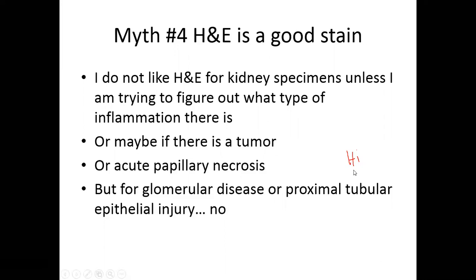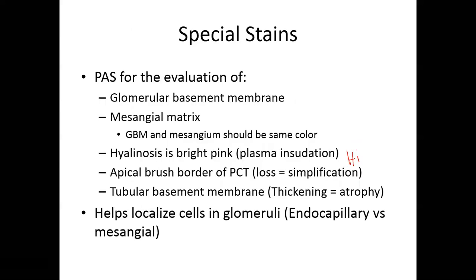And this little hi here was Mary and I practicing annotating on slides. So apparently I can start to draw on my PowerPoint slides. Okay, so what special stains should we use? And the first one is the periodic acid Schiff. That's probably the go-to one that we learned about when we were doing the WSAVA study. It was the first, oh my gosh, the hi stays there. I got to get rid of that hi. Can I get rid of it? Clear all drawing. Yay. Okay, I learned.